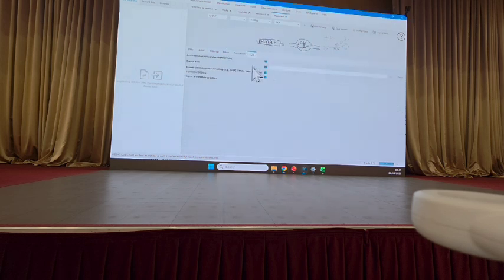And lastly, some of the, I think, most important things you could also do in MZmine: molecular networking. We want that checked. And then we want an export path.